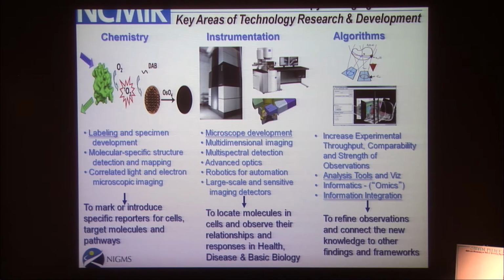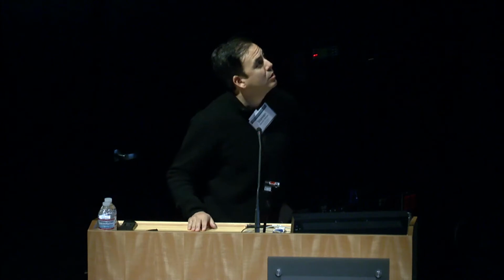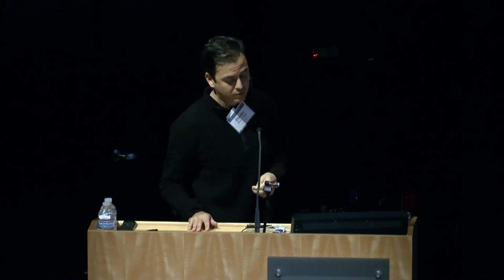We develop very customized instruments, both to exploit what is possible in new specimen development technologies, but also to push multiscale microscopy capabilities in terms of resolution, contrast, field of view, and throughput. And we complement our activities in data acquisition with the development of advanced algorithms and cyberinfrastructure, really to improve our ability to process, visualize, and share data, and also to connect knowledge to other informatics and computational frameworks.